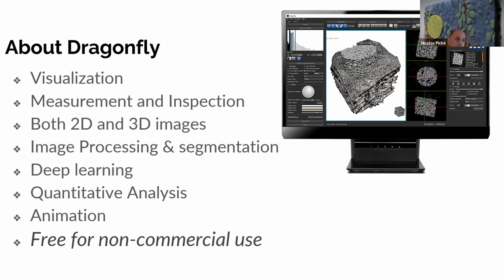Data sets of different types like byte, short, int, float, also meshes, and regions of interest of two kinds: multi-ROI, which is a multicolor, auto-exclusive region of interest, and single ROI, which is like a binary segmentation.